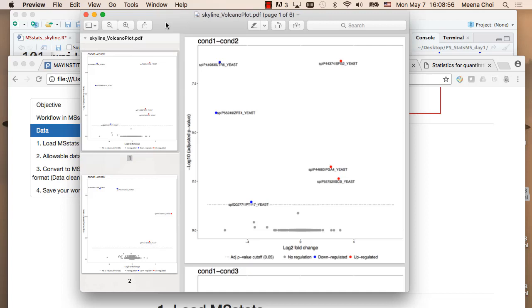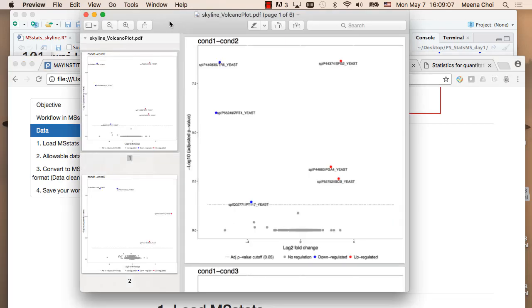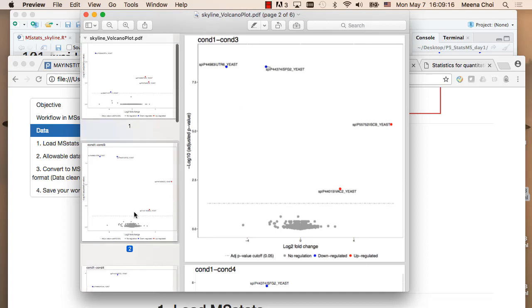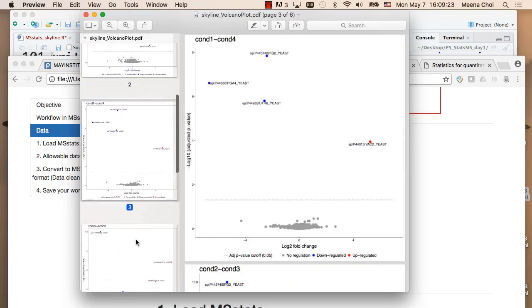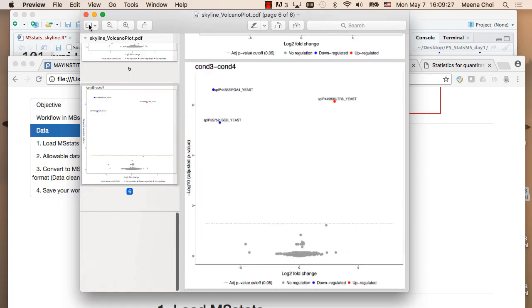And then here, especially this Q2771, actually this should not change, right? So we can see the test result, and the next plot is compared to other comparison. Here we have only 4 significant, which should be 6, and then here's also 4, and so on. So here is the summary of the whole testing result.